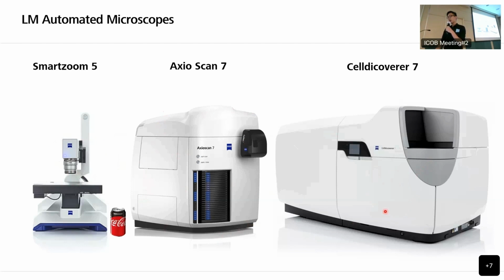And this one is called Cell Discoverer 7. This is the automated inverted microscope. You can imagine we can cover the whole LSM 980 into this one.